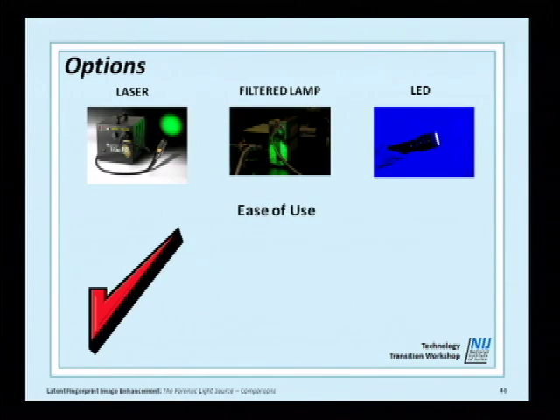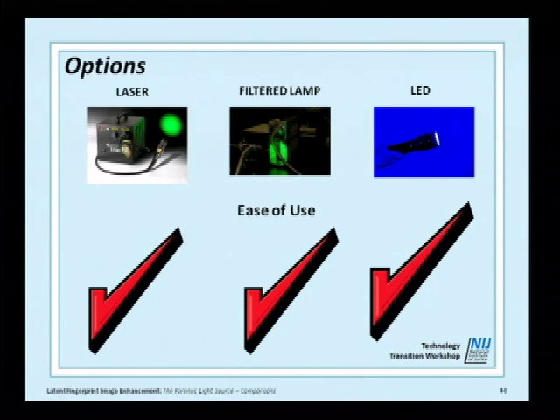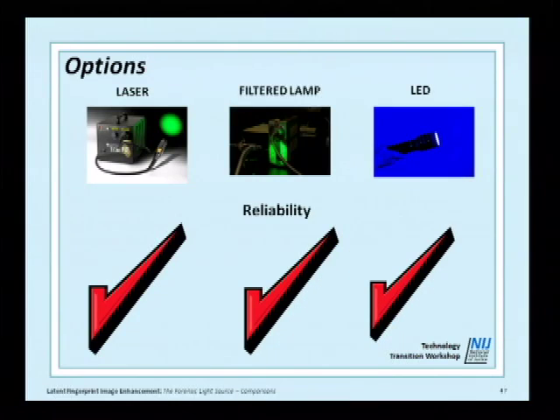Ease of use. And I give a slight nod to the LEDs again, simply because they're small. You can position them easily and move them around, and it's not quite so easy to do the others. And we're going to have first-hand experience of that this afternoon when we start in by looking at the samples. Reliability. I think they're all kind of at their operational optimum now.